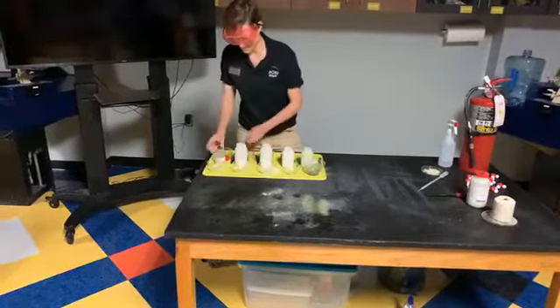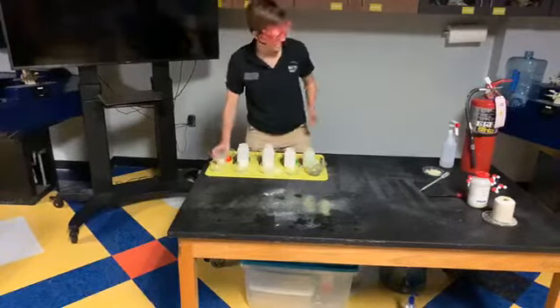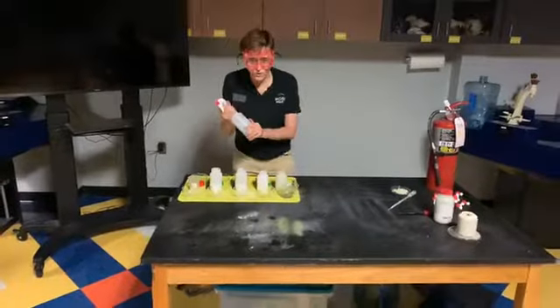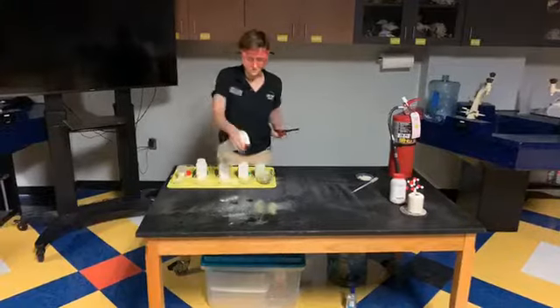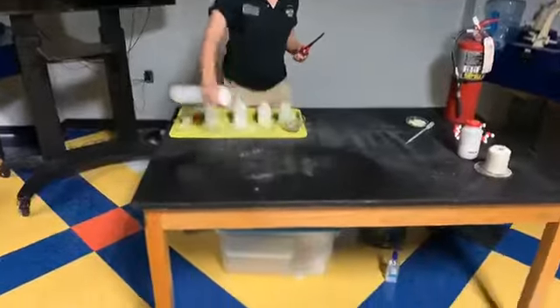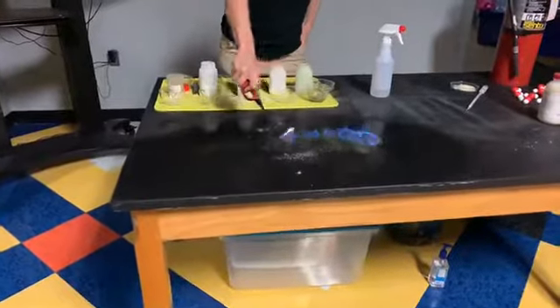So let's see. Put a little bit of regular table salt just for good measure. And we'll do the same thing that we did at the beginning. Remember, we have our fuel, we have our oxygen, and we have our spark. Let's get quite a bit there. And let's see if we can't make a rainbow flame together before we go.